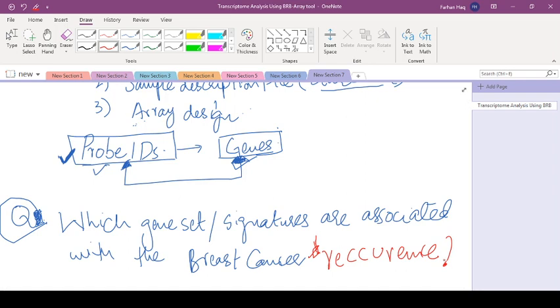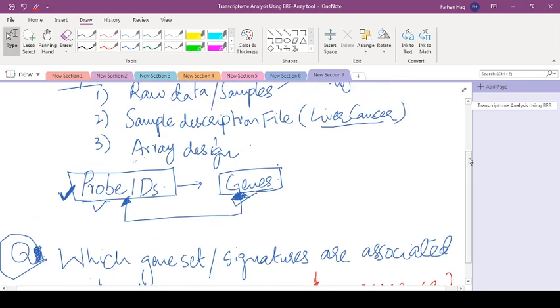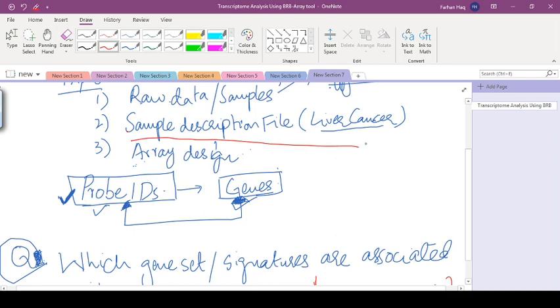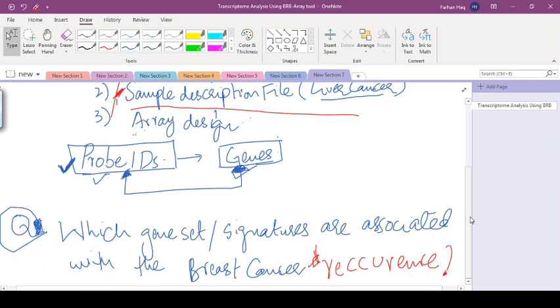What we need for this is raw data that is associated with breast cancer and the expression. Along with this expression information, we need the sample description file which should contain the information of patients and the recurrence information, so that we can compare the raw expression information after processing with the recurrence information and come up with the answer: which genes are associated with the tumor recurrence.